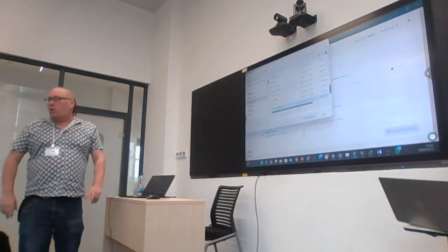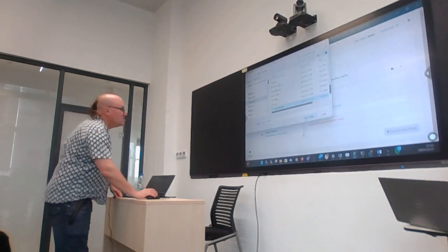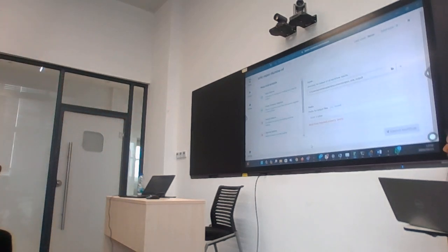And then I select the folder, okay? Can everybody double check that they've made a new folder for the output location, and they did select the folder? Okay?